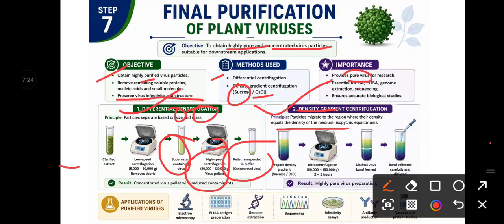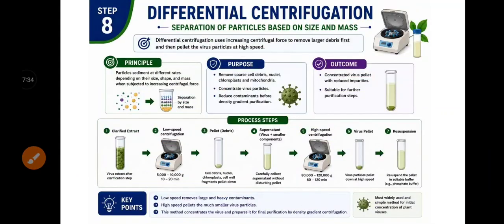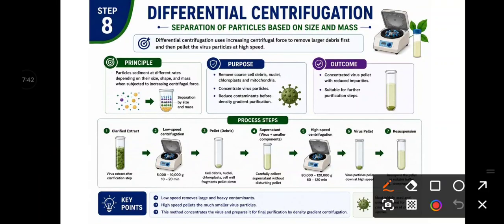But in differential centrifugation no such gradient is used. Particles are separated based on size and mass.